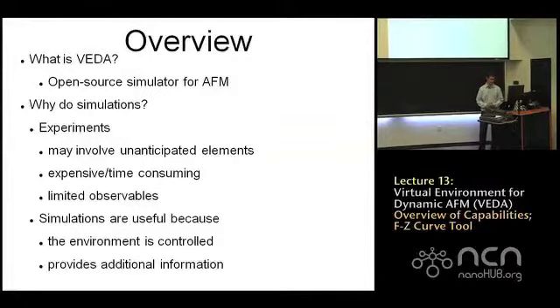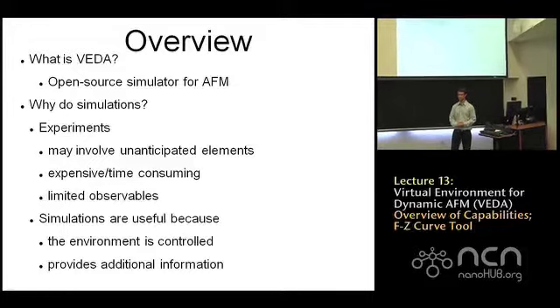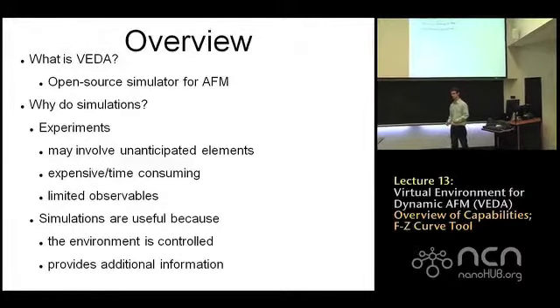So an overview, what is VEDA? It's an open source simulator for dynamic AFM, which simulates most of the important experiments that we would do in AFM. It's open source, so you can download the source code if you want to and modify it. But also, it's accessible freely from NanoHub, which means you can just simply log on to NanoHub's website and run it on their machines from your computer. So you can actually just run it through a web browser.